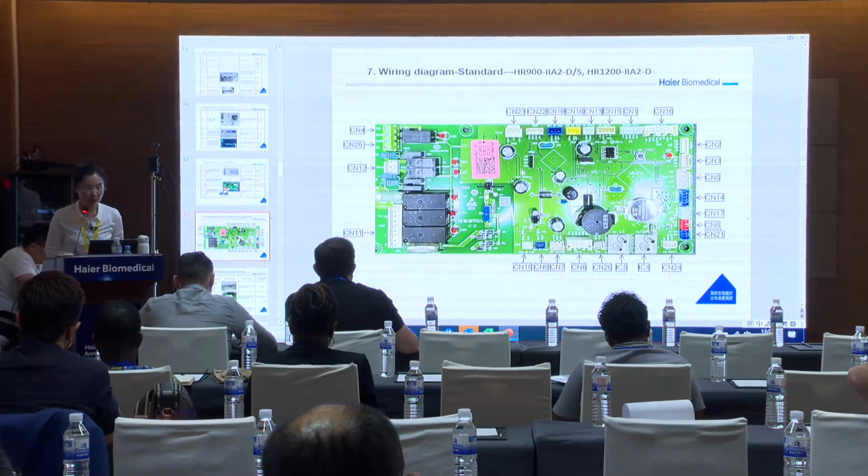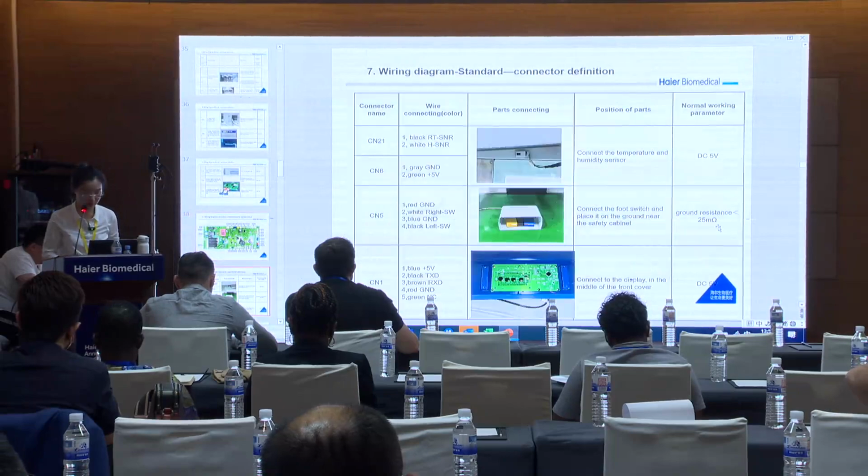And this is the standard main control board connector definition. The same.